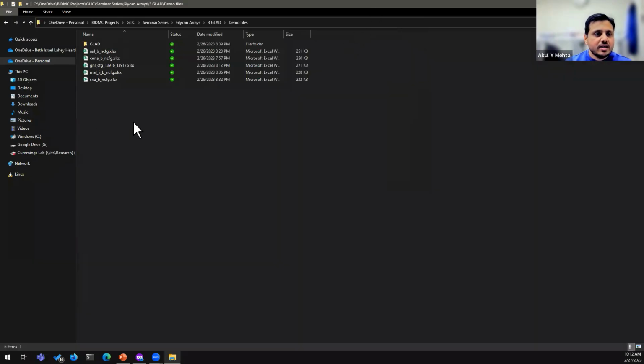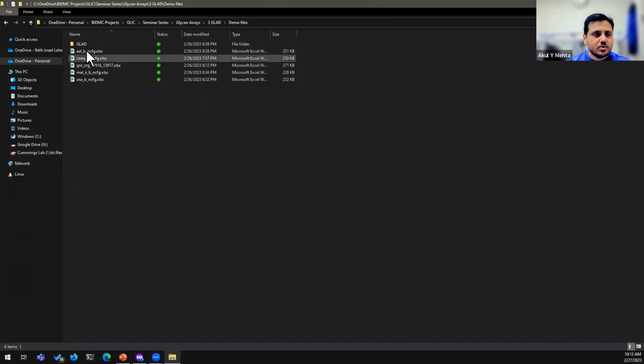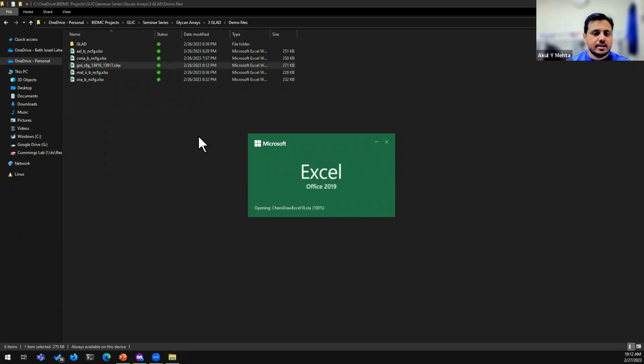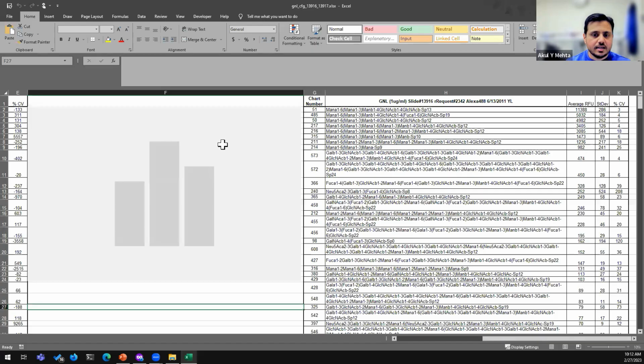Okay, thanks, Yuki. So just to give you an idea of what we will go through. I downloaded datasets for glycan microarray data either from the NCFG website, which is our website at the National Center for Functional Glycomics, or the CFG website, which was the Consortium for Functional Glycomics website. So the GNL dataset is from the Consortium for Functional Glycomics, whereas the others are all from the NCFG website. So let's just open the GNL dataset and see what it looks like in Excel.